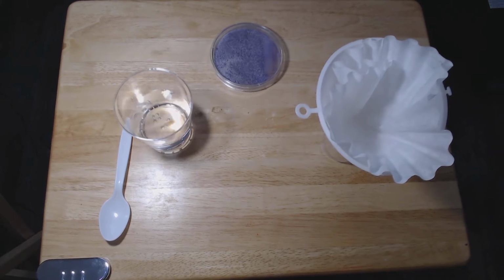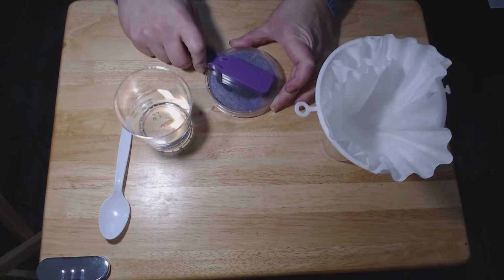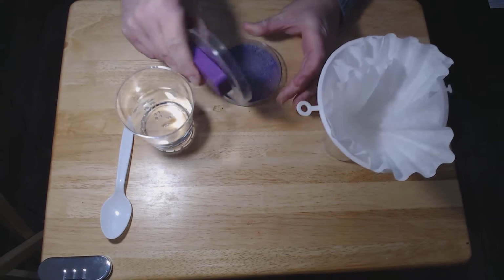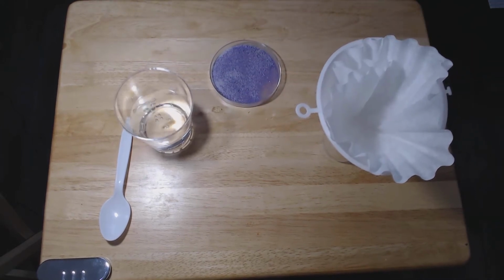Now we are going to use the properties that we showed in the last video, magnetism and solubility, to separate a mixture of sand, salt, and iron. The first thing we are going to use is magnetism. So when I run the magnet over the top of our mixture, what ends up happening is the iron gets stuck to the magnet and it is separate from our mixture.